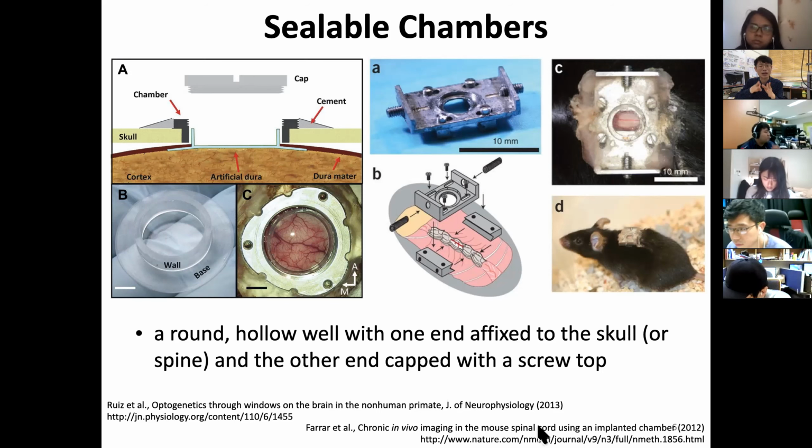You can watch them over time, and this allows us to study, for example, pain. You can have a pain model by directly hitting the spinal cord, giving damage, and see how this damage affects things at the cellular level, for example microglial activation, or glial satellite cells.